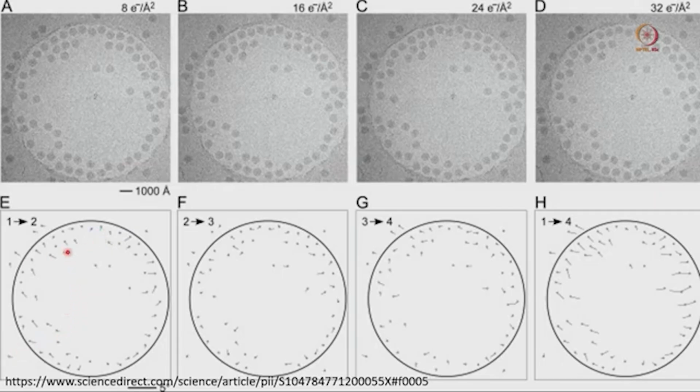That is what we can observe here. We can see that for some of the particles there is almost zero motion. If you consider this particle, or this particular particle, there is no motion, but for some particles there is a huge movement. Some particles have very limited motion.